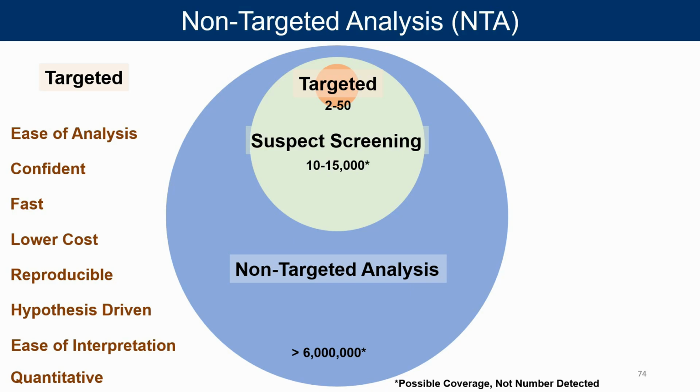It's reproducible. You're actually getting units in concentration. So, for example, parts per million. And that quantitative answer is very important, right? Because we want to know it's not whether PFAS is in your blood or not, it's how much. And if it hits a certain threshold, it might be toxic, whereas below that threshold, the effects might be minimal. So we really want to know how much, and then we can compare between labs because we actually have a known value. It's hypothesis driven, so we have a question about certain molecules that we expect to change, and then we'd be looking at those molecules.